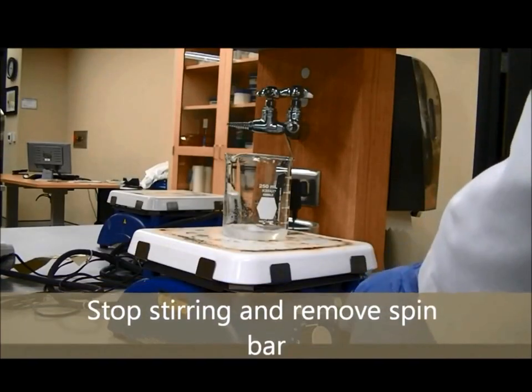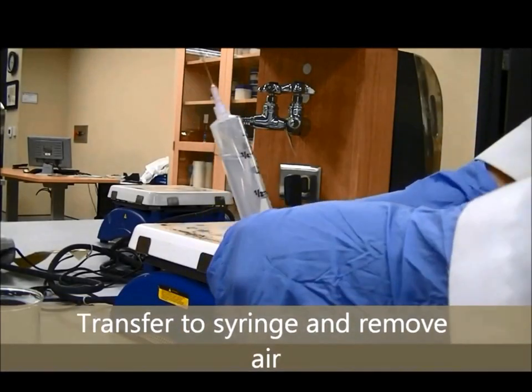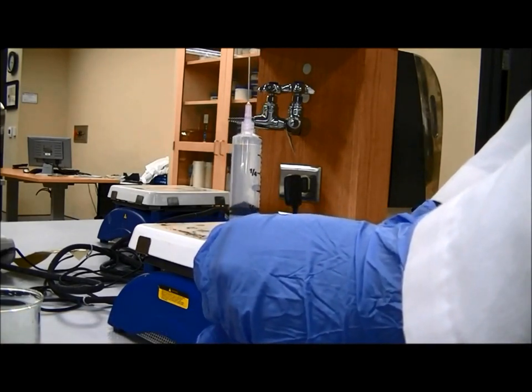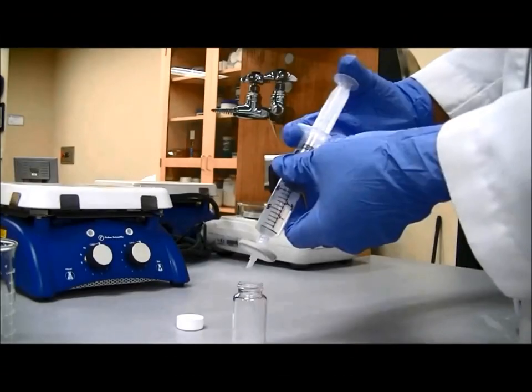Now stop stirring and remove the spin bar. Transfer the solution to a syringe and remove the air. Push the solution through a teflon filter into a dispensing bottle.